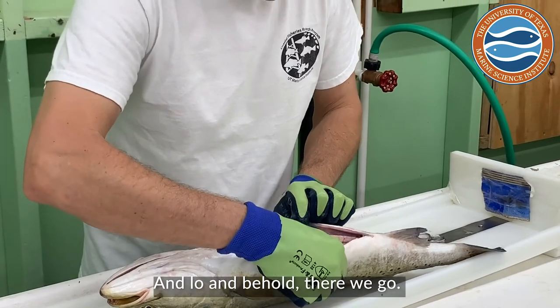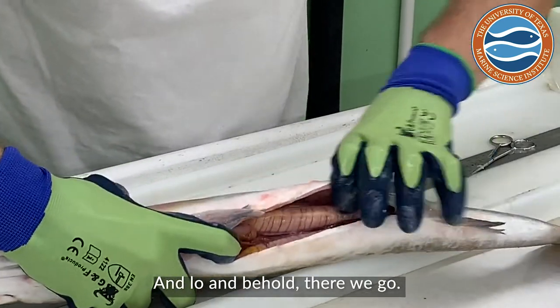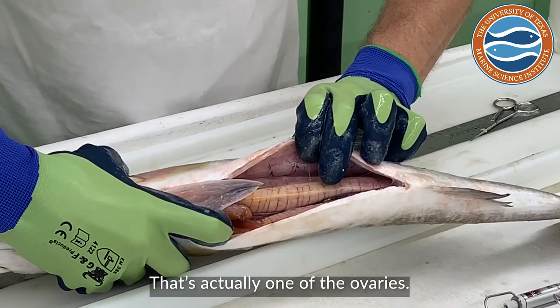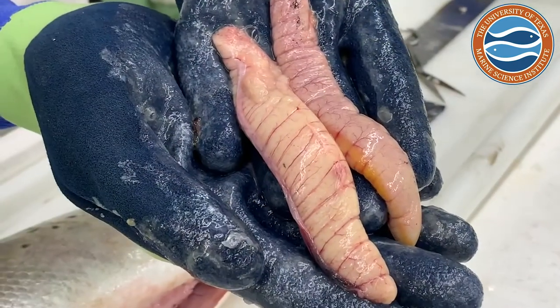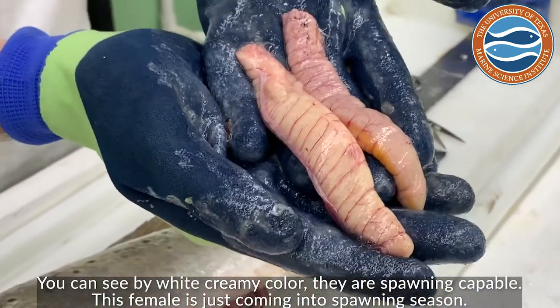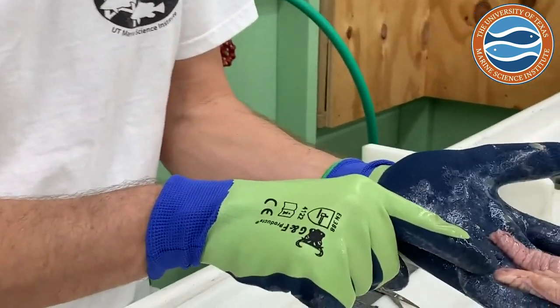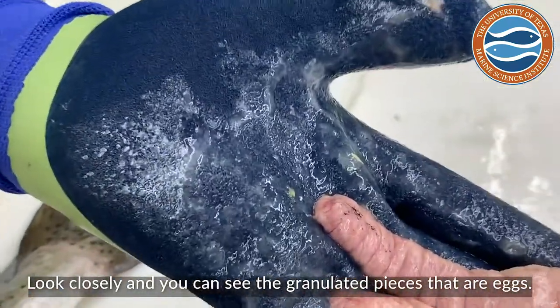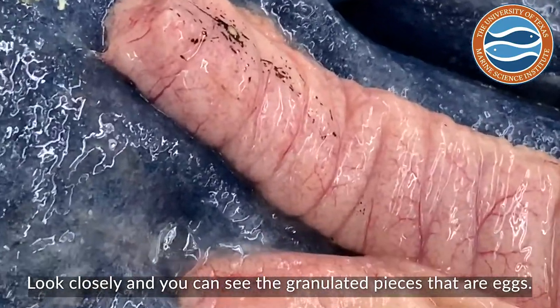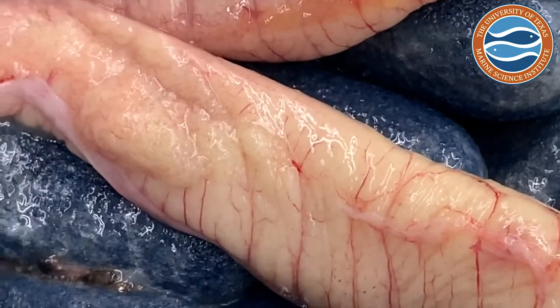And lo and behold — there we go. You can actually see them pretty well. You can see these organs on my middle finger here on my left hand — that's actually one of the ovaries. You can see by the white creamy color that that's evidence they are what we call spawning capable. This female is just coming into the spawning season. If you look really closely, these granulated pieces here are actually individual eggs we call oocytes — those are the eggs that the fish will eventually release into the water during spawning.